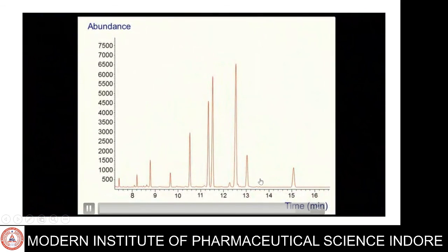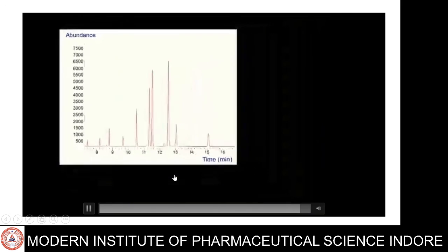This is the graph of chromatographic system, and these all are separated compounds.